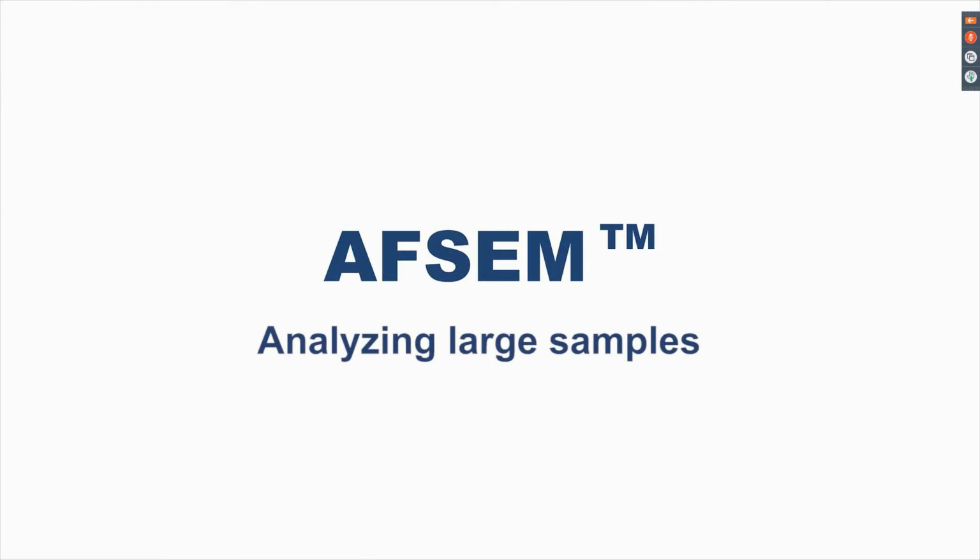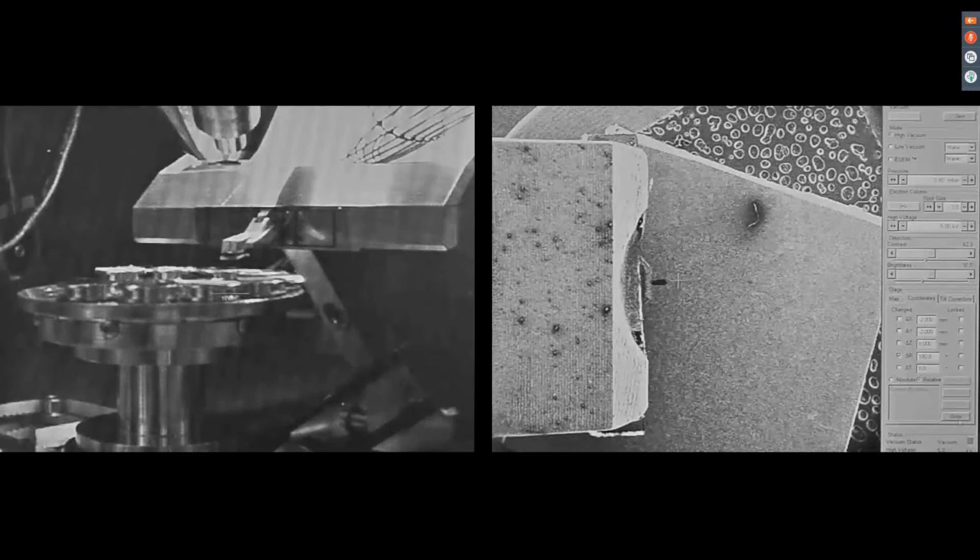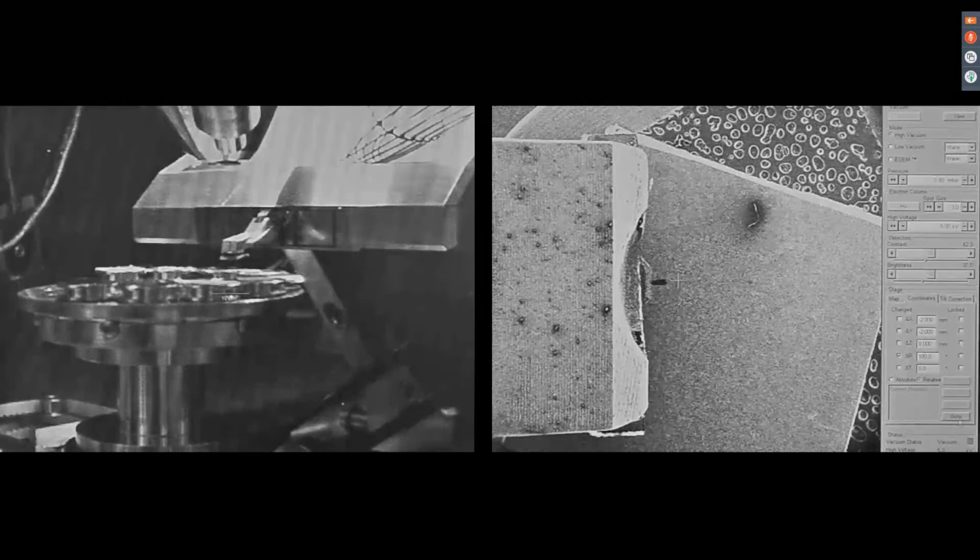The analysis of large samples is depicted now in the following split screen video. Let me pause this video here to explain what you see. On the left side of the video, you see the image of the infrared camera. You might recognize the sample holder with all different samples in the center of the image. In the background, you can see the AFSEM scanner.